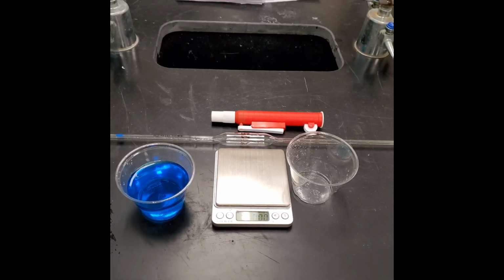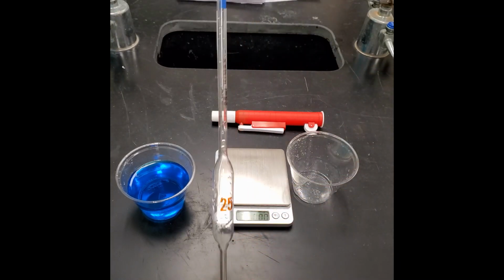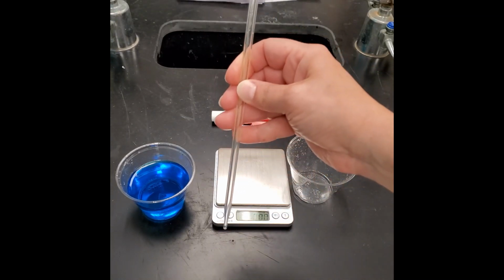Okay, for this part of the lab, I have the equipment set up. This is the second part. Now, if you are level 2, 3, you didn't do the first part. I provided you with the calibration curve. If you are level 1 and honors, you now have made your reference solutions and you are now ready to determine the density using what is called a pipette. Now, this is a pipette. This is something called a volumetric pipette.